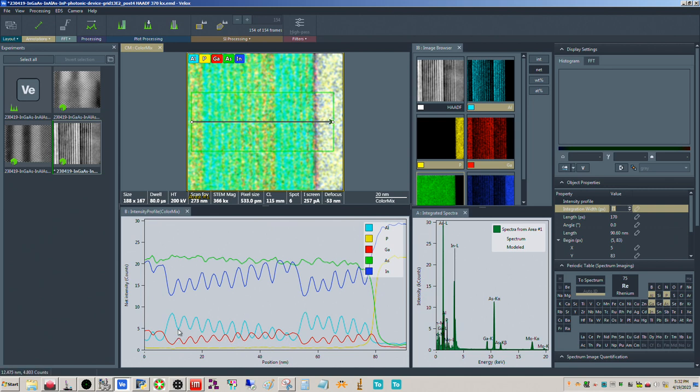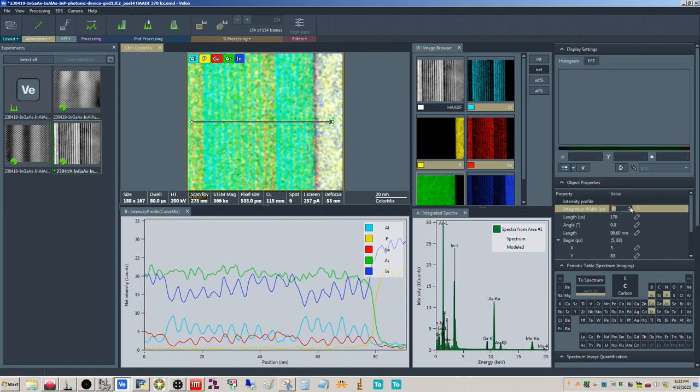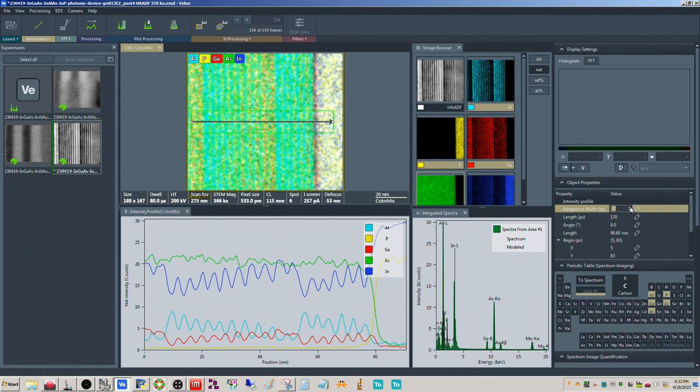You can see the same thing, the undulation with the three elements here. So you can even push this all the way across. This is actually doing an average across the line, because the numbers aren't getting any bigger. The numbers really aren't any different. So this is an averaging effect. It's actually not an integration. Technically, it's an averaging. And let's do 100, just a nice round number. And there you have it.